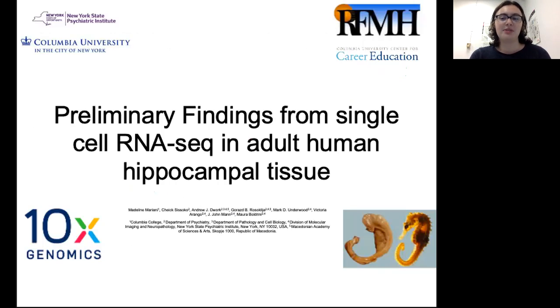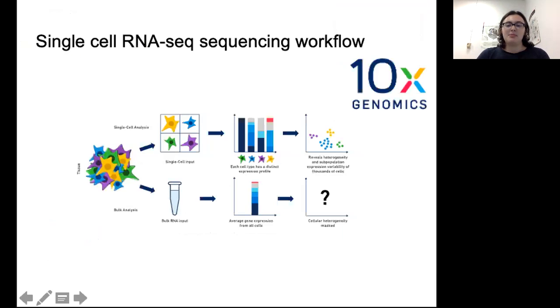And this summer, I worked at the Ultrani Lab studying hippocampal neurogenesis. One of the projects I'm working on is single-cell RNA-seq data analysis from post-mortem adult human hippocampal tissue. So first, I'd like to say a little bit about the experimental and data processing workflow.